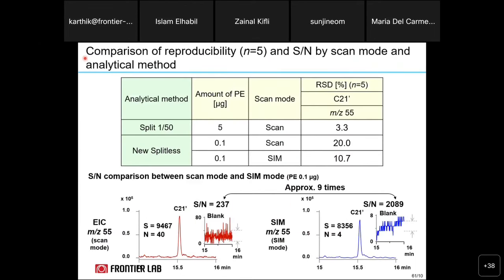Next, we compared the reproducibility of each analytical method and signal to noise in scan mode and SIM mode. Reproducibility was inferior for the new splitless method.